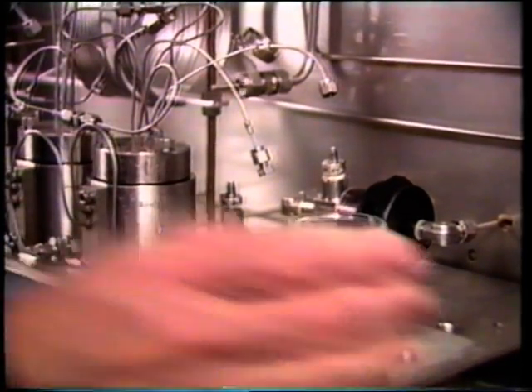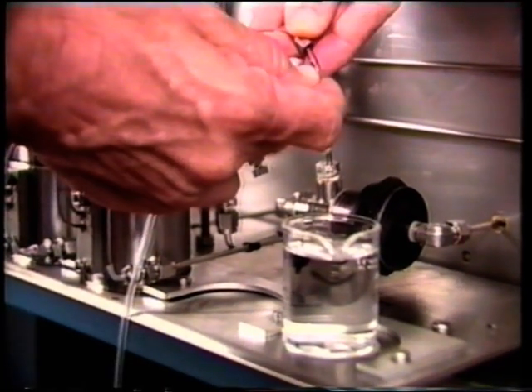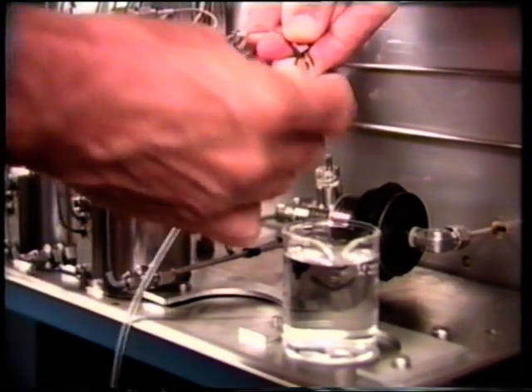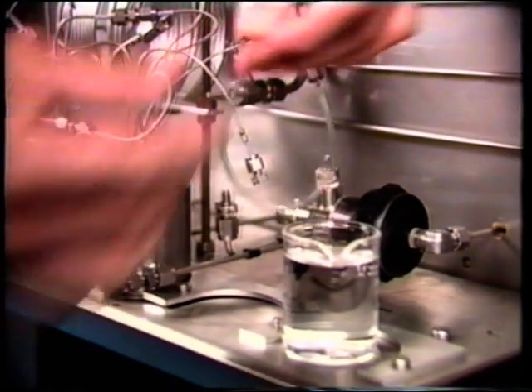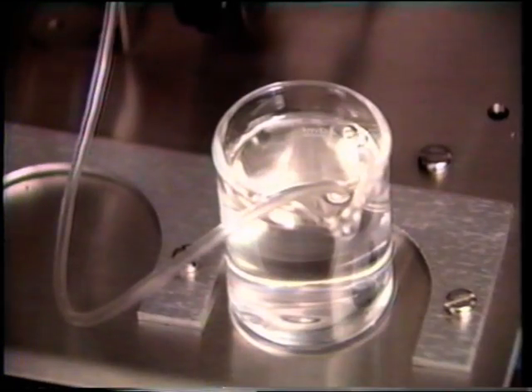To test for leakage, ensure carrier gas is connected to the carrier port. Cap the sample inlet and sample to column ports and attach a clear tube to the sample outlet port. Be sure that the pressure is maintained at normal operating pressure. Immerse the clear tube in a beaker of water. Bubbles indicate an internal leak.